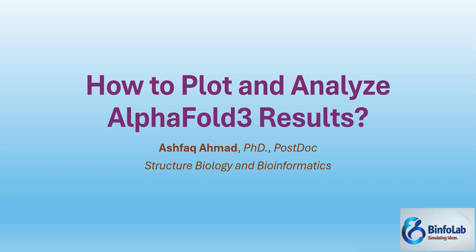But this video is all about once you finish the prediction on AlphaFold3, how will you plot those results which are mentioned on the server. Normally if you want to use that result for your manuscripts or research papers and you're using a snipping tool, that will not generate a high resolution picture and journals will ask you for high resolution. So let's start.